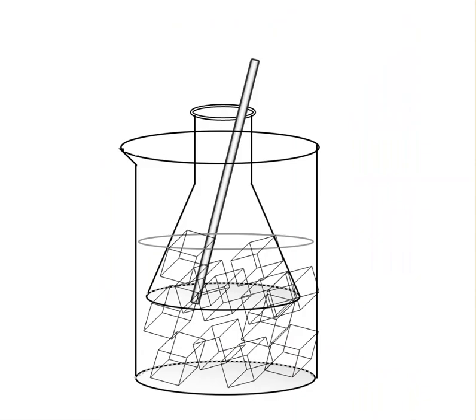After we let it cook for 15 minutes, we're going to add some cold water to it, which will deactivate any leftover acetic anhydride. It will make it turn into acetic acid, which is basically the acid in vinegar, so it makes it a little safer. But also the cold water is to help it crystallize.